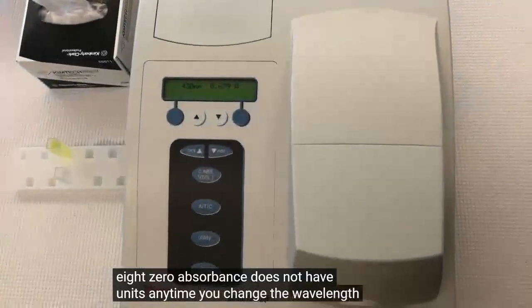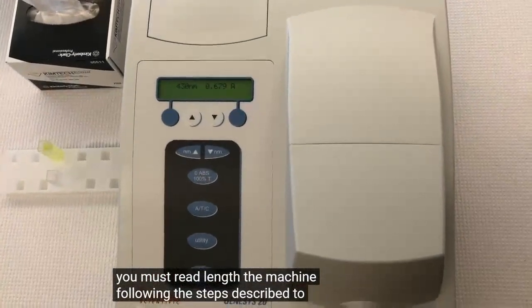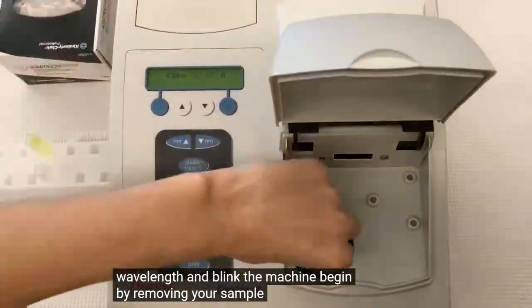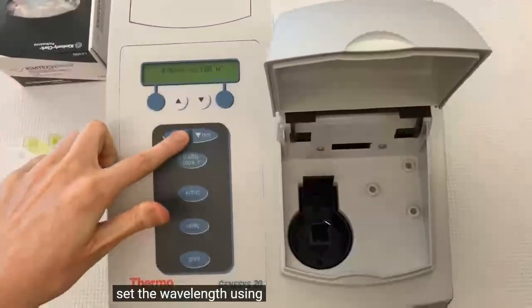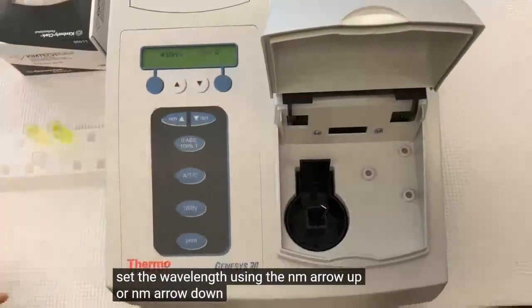Anytime you change the wavelength, you must re-blank the machine following the steps described to set the wavelength and blank the machine. Begin by removing your sample. Set the wavelength using the NM arrow up or NM arrow down.